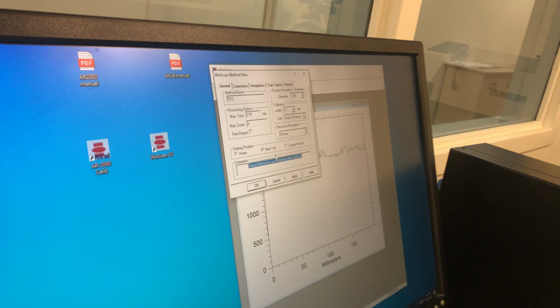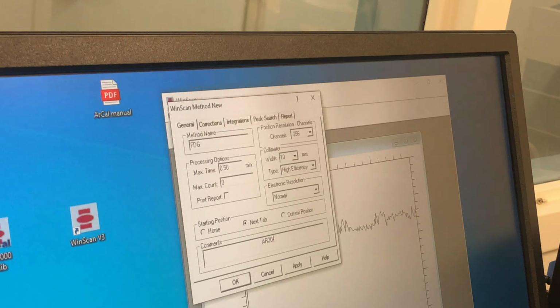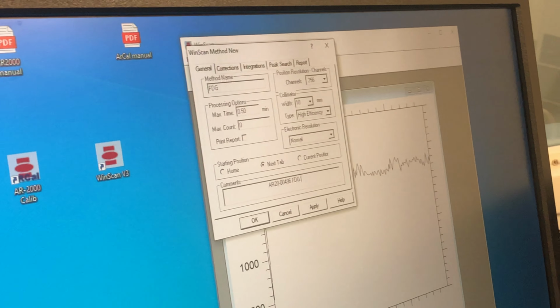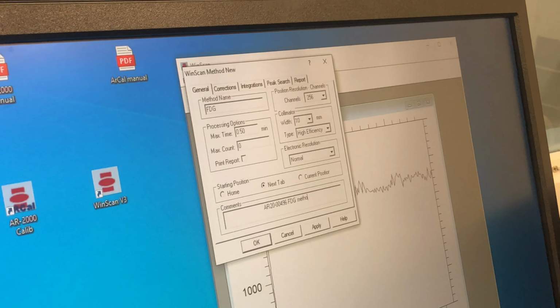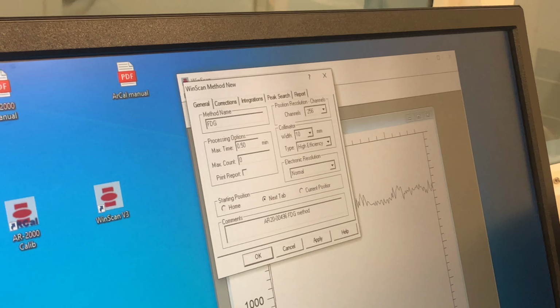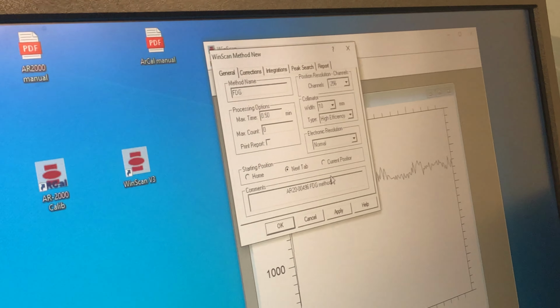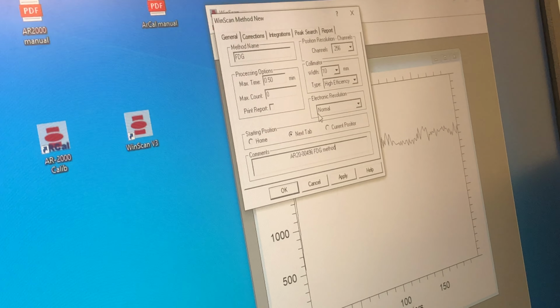Now, very often, I like to put the serial number of the detector in the method, because there's no place to put it. So I often put that in here. Why do you need the serial number of the detector in your method? That will show up in the report. Otherwise the serial number of the detector doesn't show up anywhere. I'm a service guy, so I work with instruments, so I think a serial number is important. That's the bottom line.